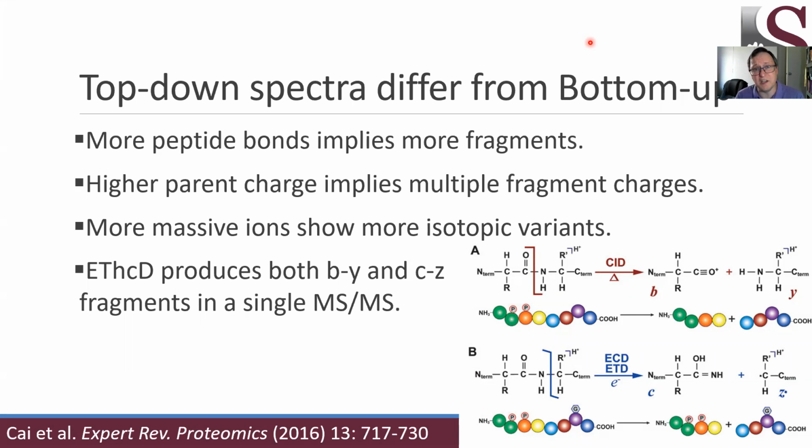So we've often seen that people who are dealing with very large ions that take on large charge use a technique called electron transfer dissociation, ETD, which causes, as you can see at the bottom right in this slide, instead of having a breakage at a peptide bond, like you would see in most shotgun proteomics that produces a B-Y pair of ions from the breaking peptide, we see that our breakages are no longer at the peptide bond, now they're between the nitrogen and the alpha carbon. And it's produced by a very different kind of process.